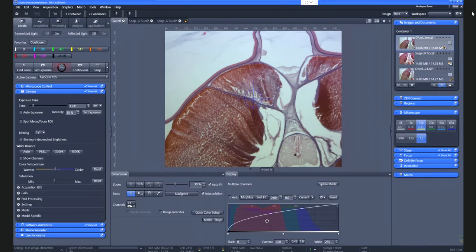So this is a little bit like if you open the camera on your smartphone, it would automatically start and set an exposure which is appropriate to whatever you want to take a photo of. Okay. Last but not least, with a color camera, we do have to do something about the proper display of this image, which has to do with gamma and maybe black and white settings or min-max settings, which has to do with the way of displaying this image, displaying over a certain projector on your laptop or somewhere, but does not have to do with the image intensities.